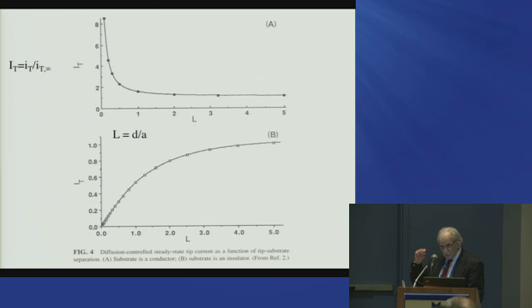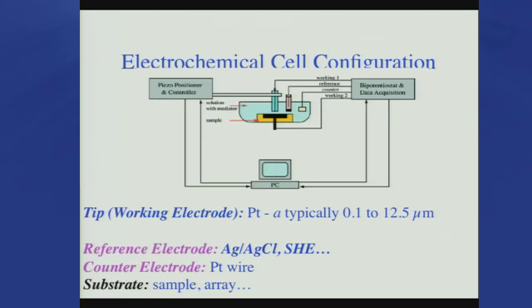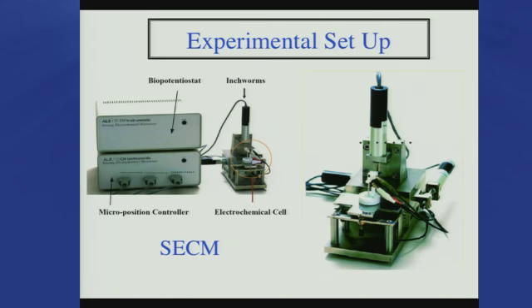And that's important because that's the d that appeared in the earlier slides that shows the distance between the two electrodes as it diffuses in. This is just a schematic of what an SECM involves. It involves usual electrochemistry with electrodes, but a means of moving this electrode with high precision up and down as you do in other scanning probe techniques. This is just a commercial one.